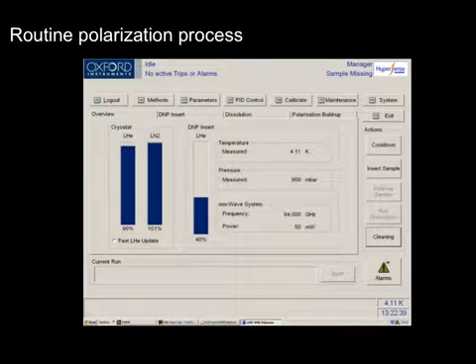So every polarizer has a sheet of paper or a logbook. It's been standardized now, I think, for the polarizers. There's a logbook that has pages of entries where you put down the date, time, and what you've done with the system, what you loaded, and so hopefully there should never really be a problem with ambiguity about whether there's a sample loaded.